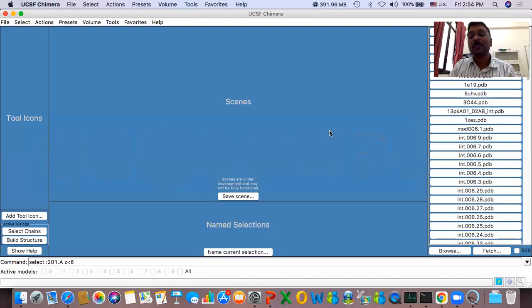After another half an hour or so in this session, I want to discuss something known as protein structure alignment. I'll talk to you for around 15 to 20 minutes about how this is done, and then I'll show you in Chimera how to do structure alignment. So any query that you have with this? Okay, someone will ask a question.